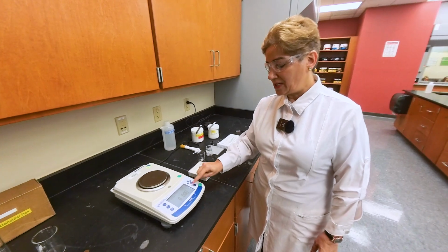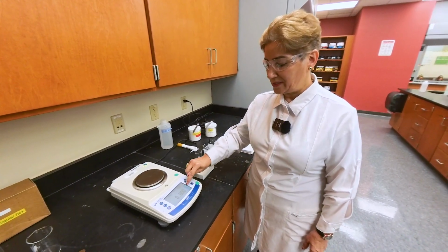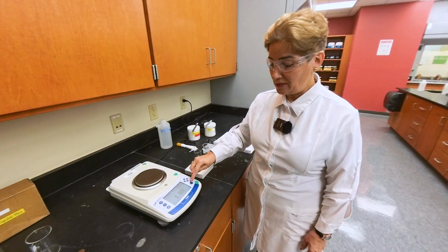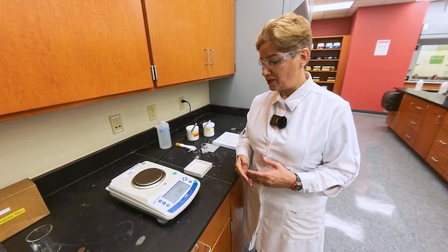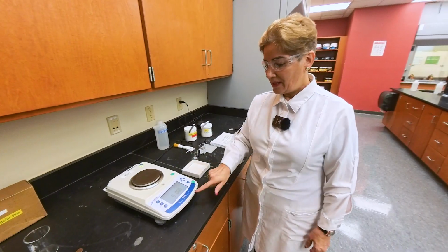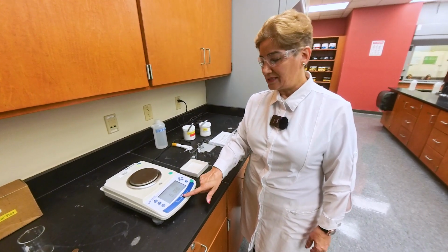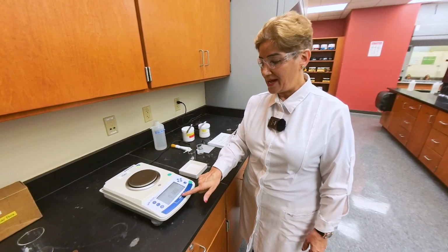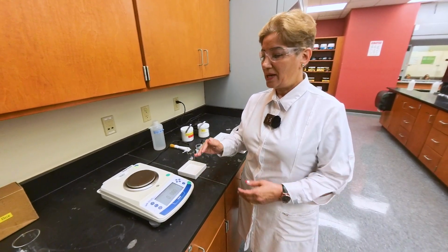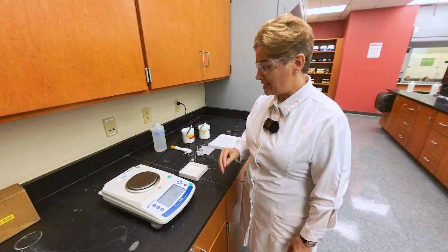We can change the unit here from gram to milligram. I'm just showing the gram and milligram option, but for the purpose of 1045, we will be using gram. There is a tare function here. What it does is ignore whatever is on the balance pan when you tare, so it starts from anything you add right after that step.